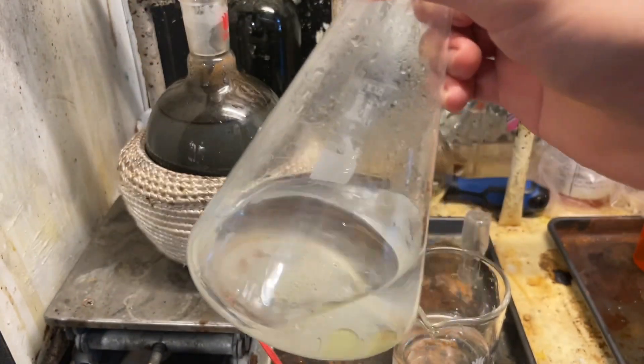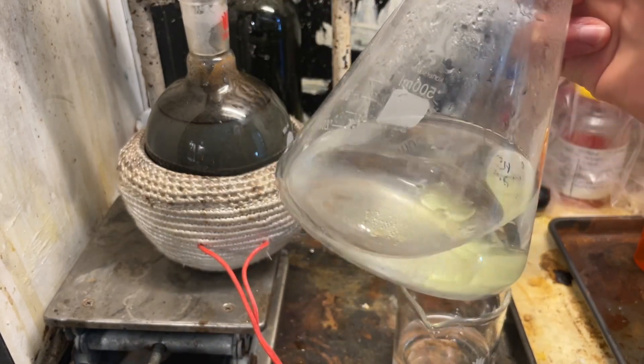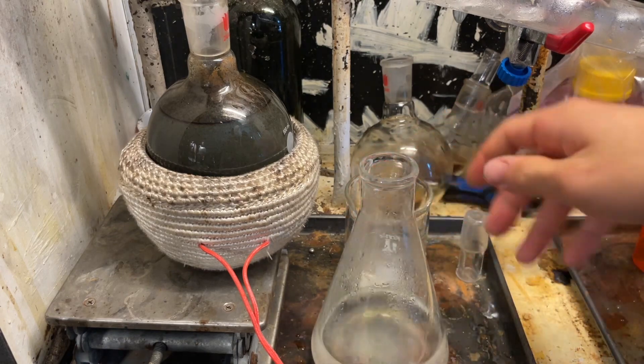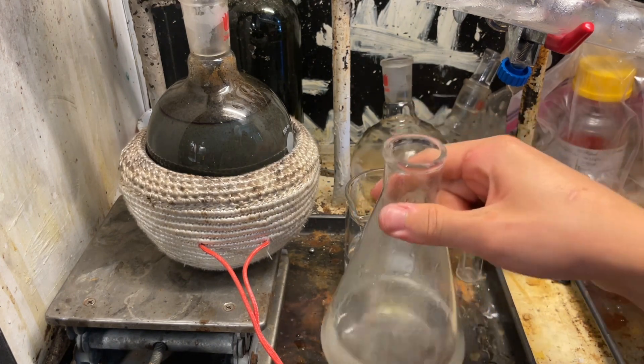Nitrobenzene is very annoying to dispose of, so I might as well recycle it into fresh nitrobenzene to use. I will not be distilling it because it's already been steam distilled, and that should be good enough purity for most of my reactions. So I'm simply just going to extract with some dichloromethane.